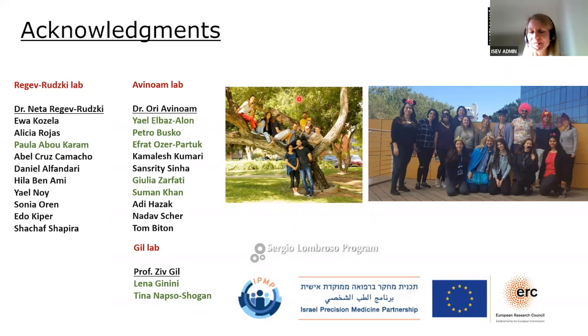And we have Rihanna. She has a question, so if you will unmute yourself, please. Okay, maybe then I'll just read it. She was asking if you checked the stability of EVs and liposomes at pH 5 separately. Yes, we did, and they are pretty much the same. With the EVs, we do see sometimes some fusion events when you just have EV alone and incubate, but we don't pre-incubate them together at 4 degrees, for example. So they are pretty stable in the sense that, especially the liposomes, they don't get damaged, they don't get deformed or change their morphology drastically.